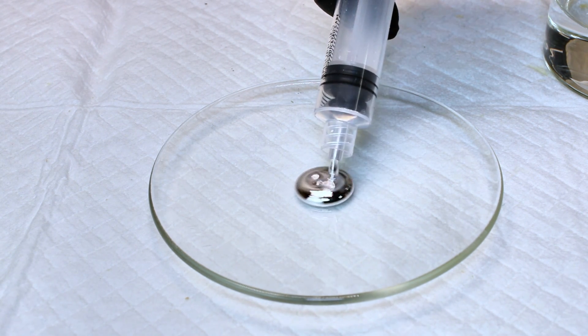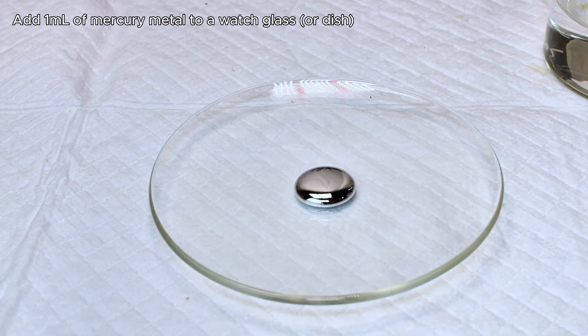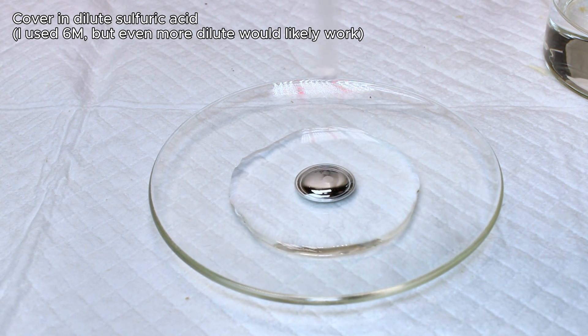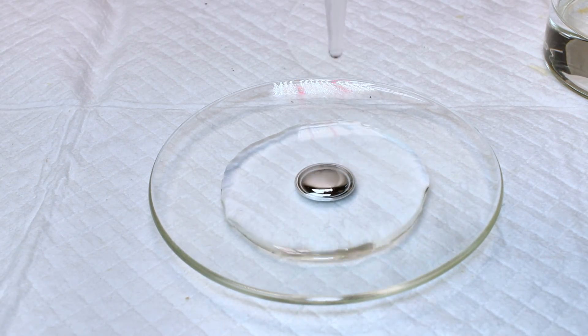To get started, I simply add 1 milliliter of mercury to a watch glass. On top of this, I slowly add dilute sulfuric acid until the mercury blob is submerged. I'm not exactly sure what the effect of acid concentration is here, and I just used a 6 molar solution.